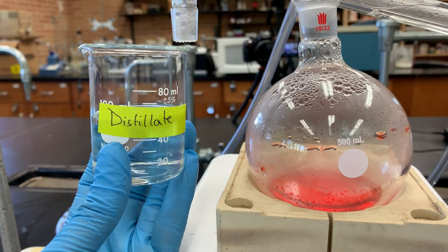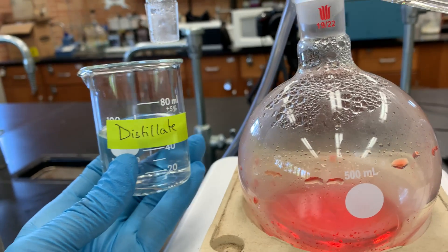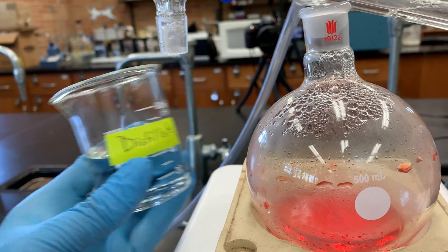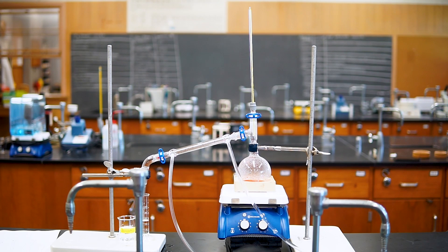And with that we have completed a distillation in which we isolated isopropyl alcohol from the rest of the mixture. As expected, we can see how clear this is compared to our colored mixture. When the boiling points of the components in the mixture are very close, we can also use another method called fractional distillation. This technique is similar to a simple distillation, except that we use a fractional column for the vapors to travel through before they hit the condenser. This column contains layers of glass beads that improve the separation between the liquids. But for today, that's all we need to know about distillation. Let's move forward and examine some other techniques.